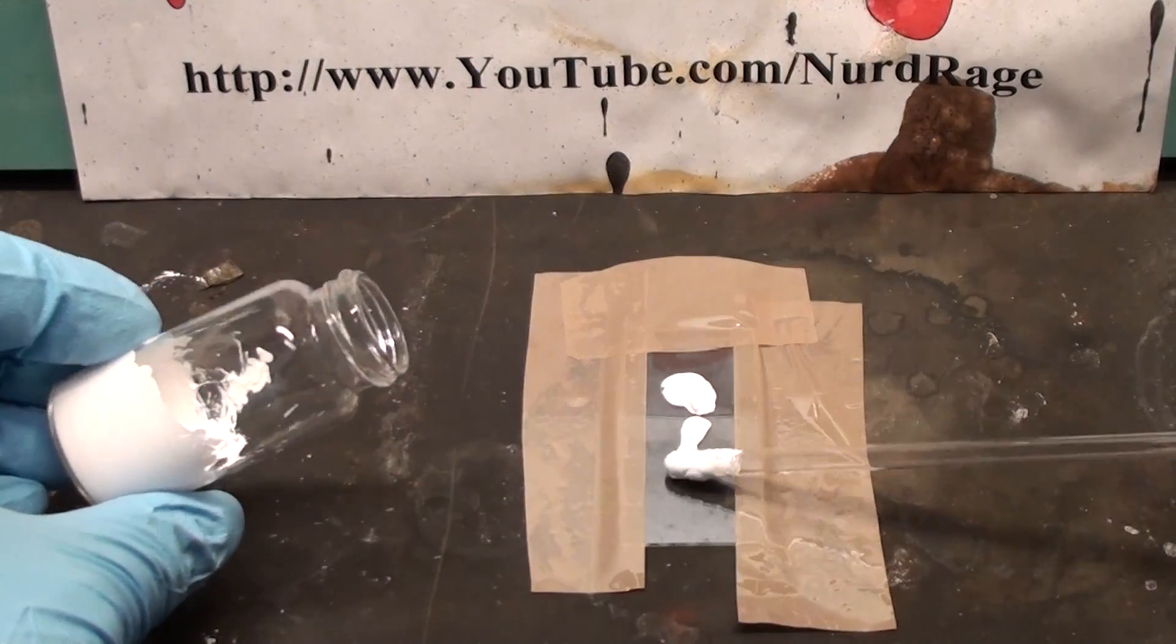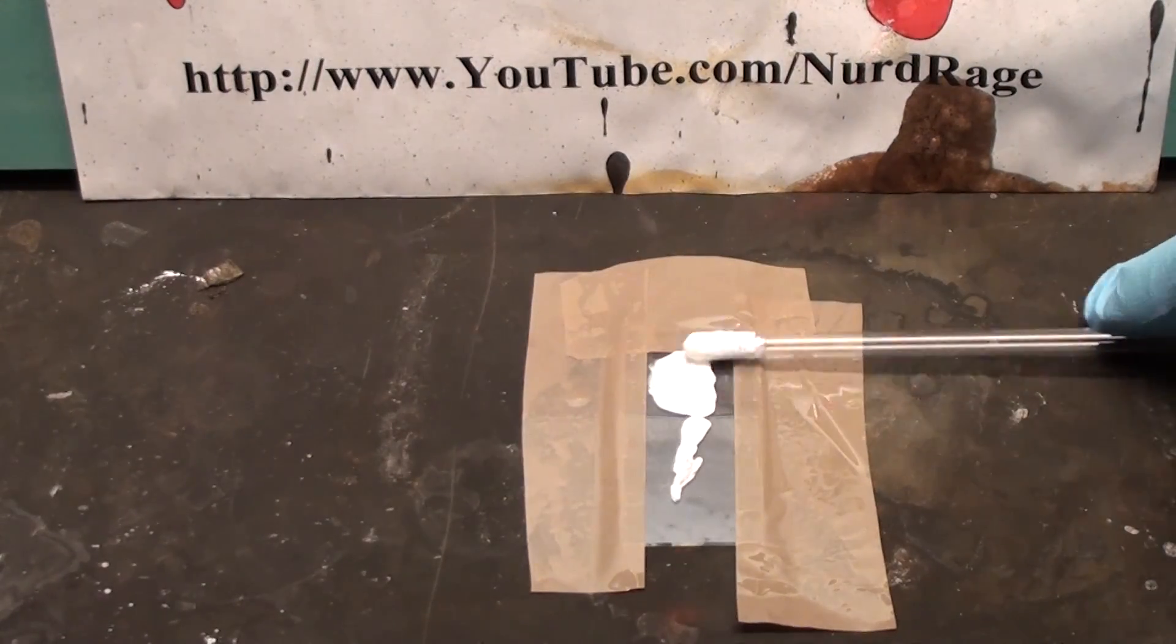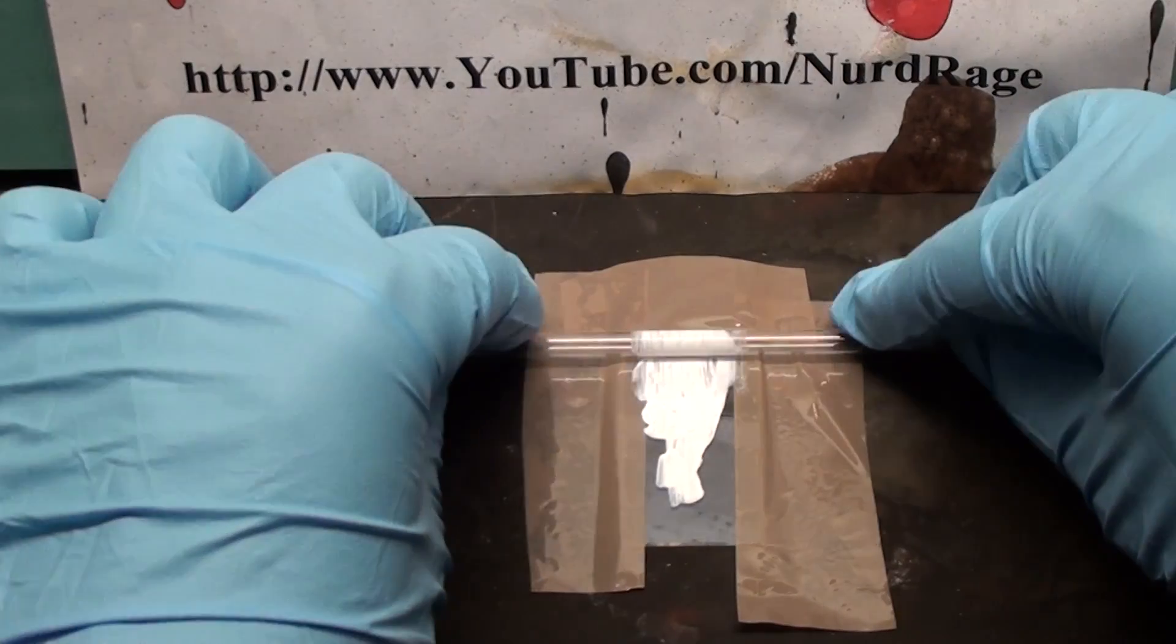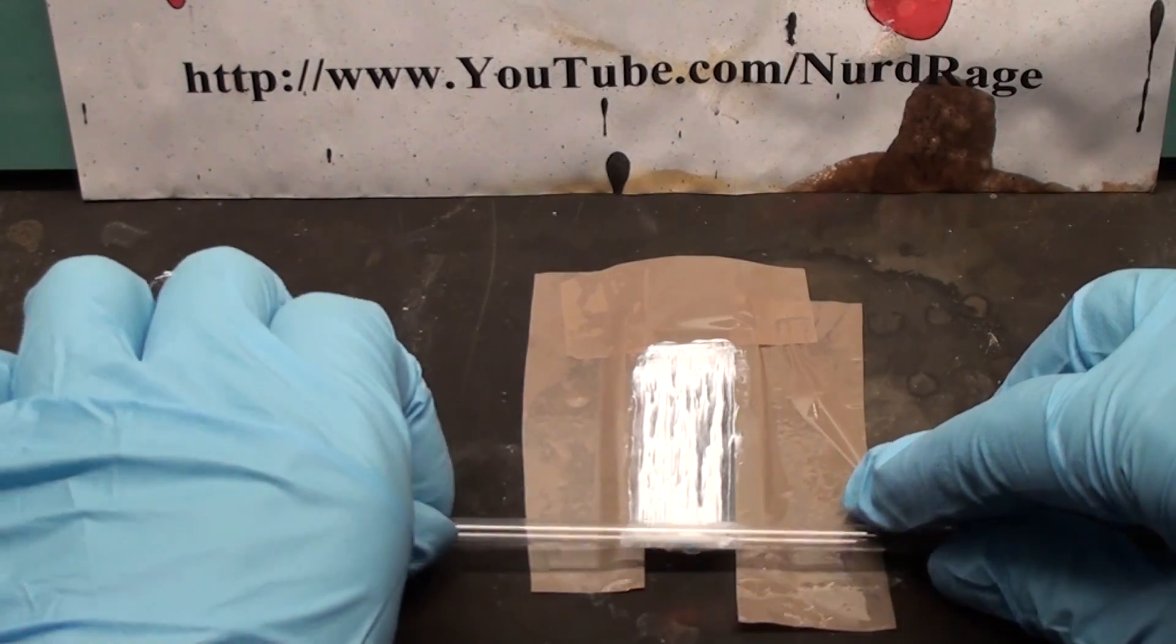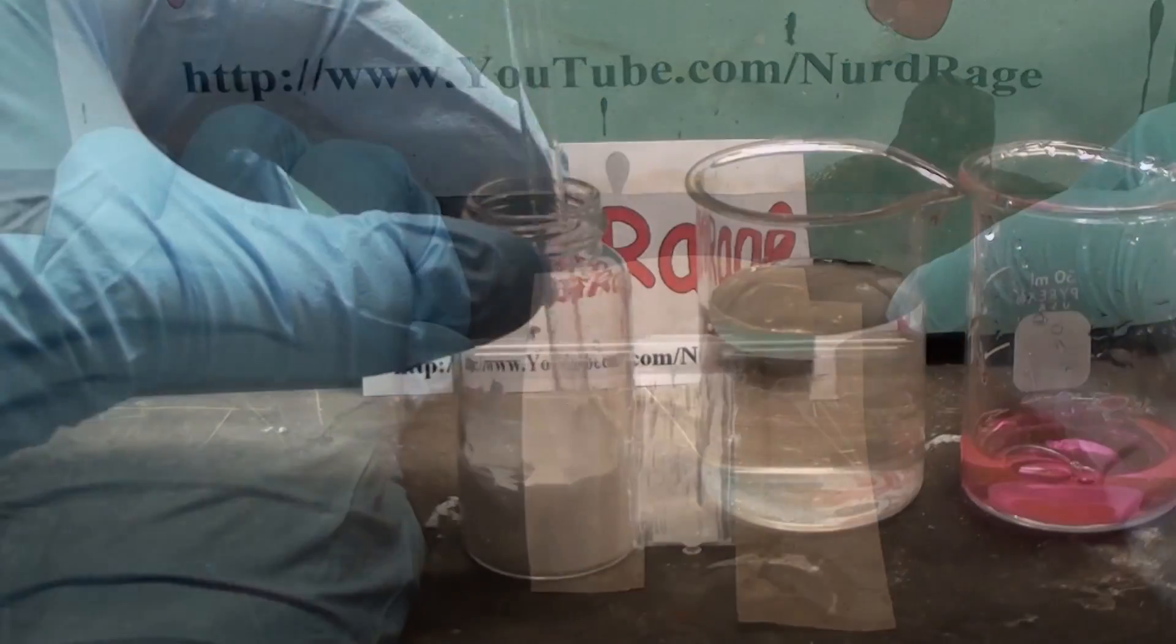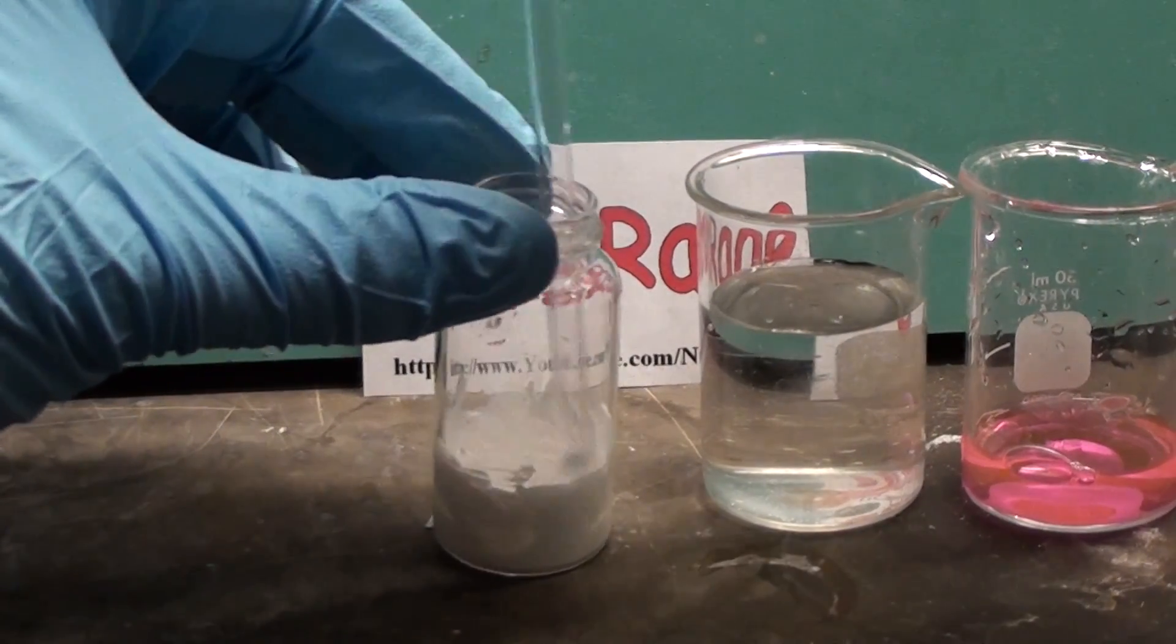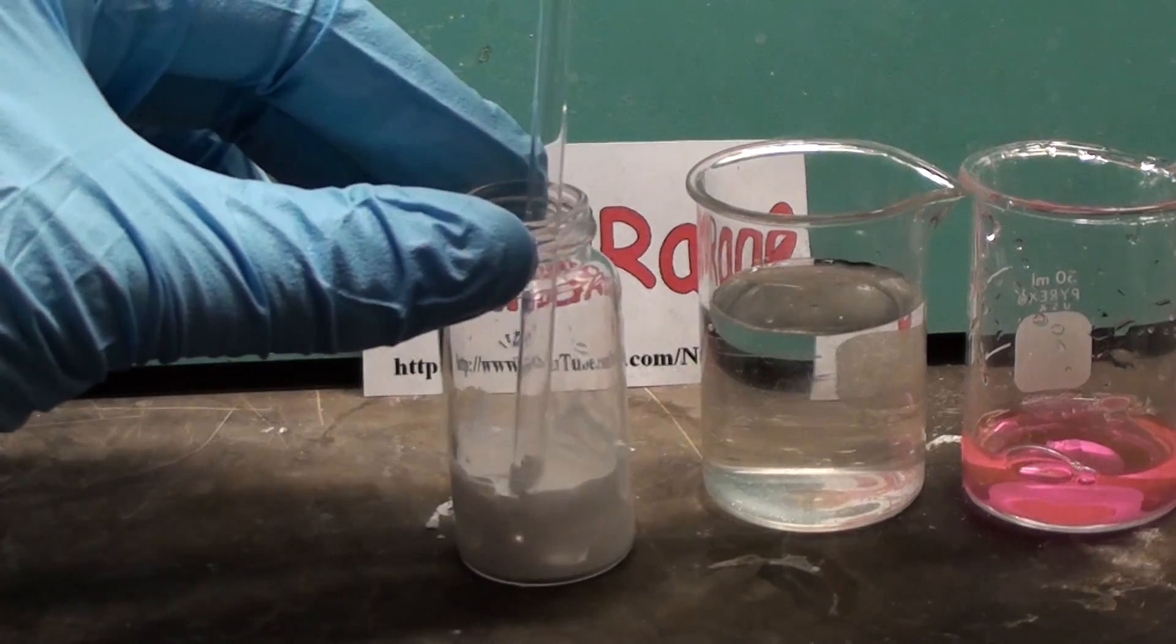Now take the titanium dioxide paste, dab it on and drag a glass rod over to smear it out. It looks like my titanium dioxide doesn't have enough water in it and is leaving these streaks. If this happens to you, add another few drops of water to the titanium dioxide and try again.